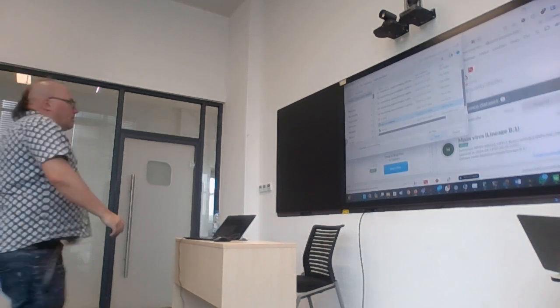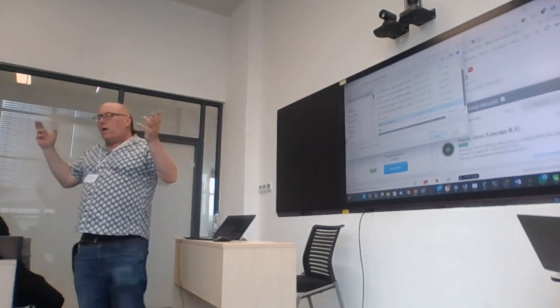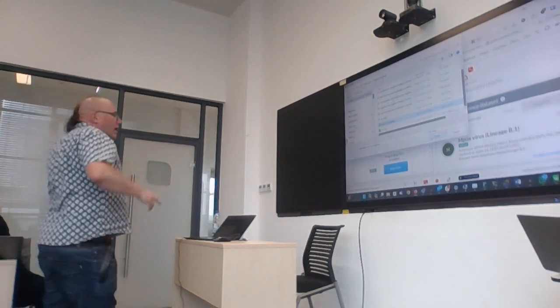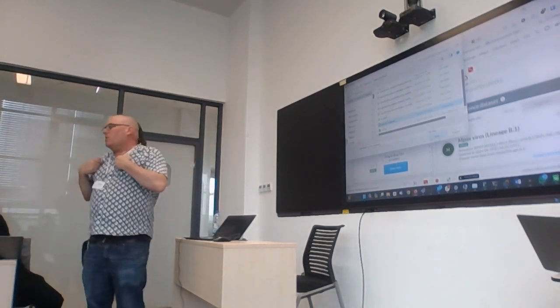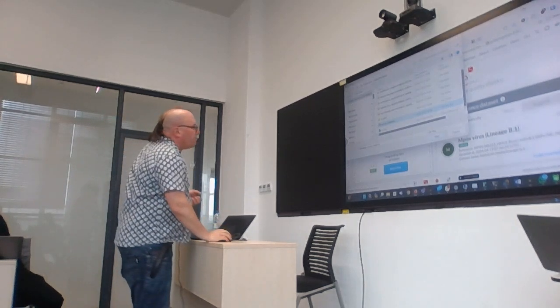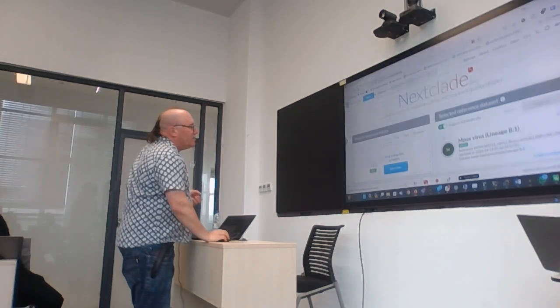So this thing over here is maybe one of the most important files that you get out of your analysis, because now you've done your sequencing, you've got your analysis, you can then do lots of things with it. This is the file that you're going to analyze to figure out what clade we've got. Is it a clade 1A, a clade 1B? Is it 2, is it B.1? What is it? Okay? All of the other files that are generated, I consider them basically for quality control. But this is the one that is for all the downstream analysis. Okay?